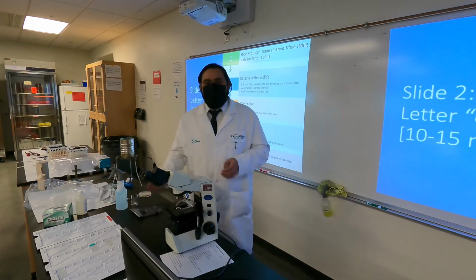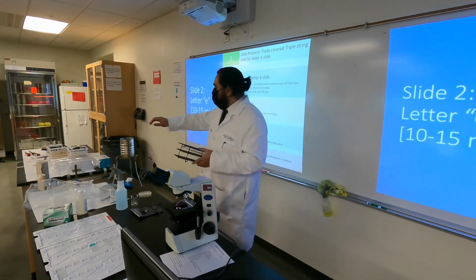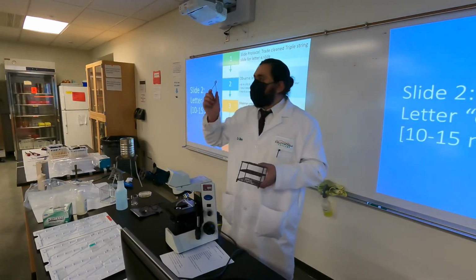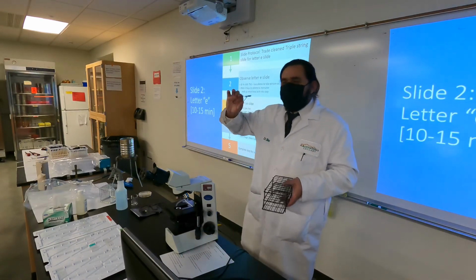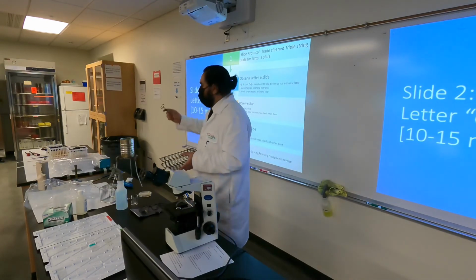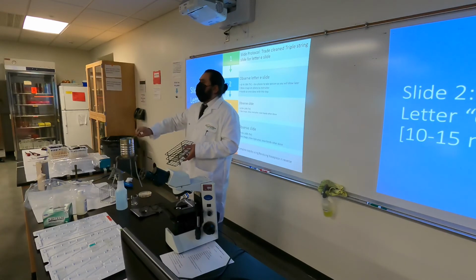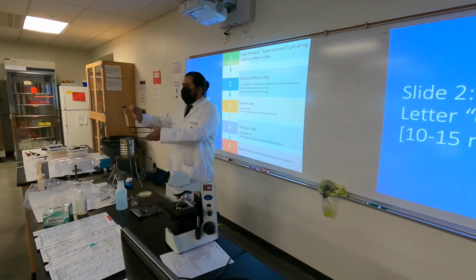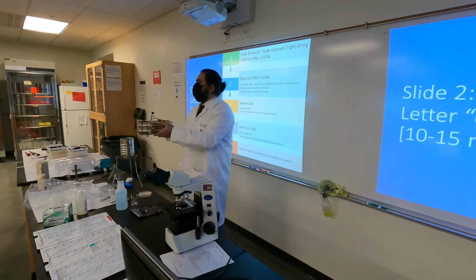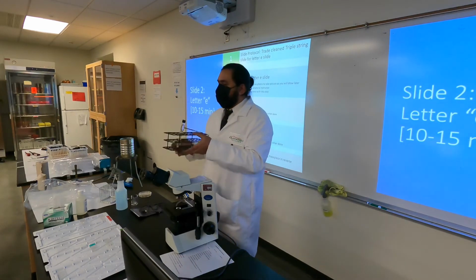Let's all go grab our test tube racks, right? We're all going to grab our wire test tube holders. And again, as a reminder, this is a reverse grip system, which means in order to hold it, you need to let it go, right? So we're gonna grab the tube, let go of the actual wire test tube holder, and only grabbing it from the little edge, transfer it to your test tube rack. Again, make sure you keep them close. That way, there's no accidental slippage or burning or anything like that.